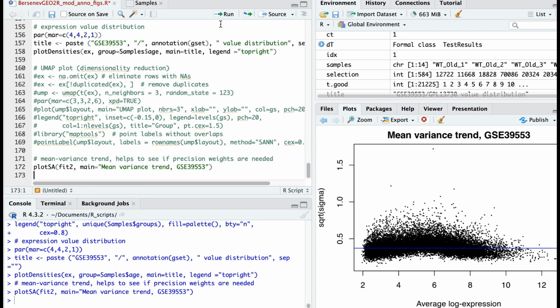So it is okay, it is good and important for diagnostics of the data, but it has to be much earlier in the script. That's all you can use. Well, you can use a lot more, for instance, heat map and so on, but this is the minimum which is useful and necessary to describe what you got.